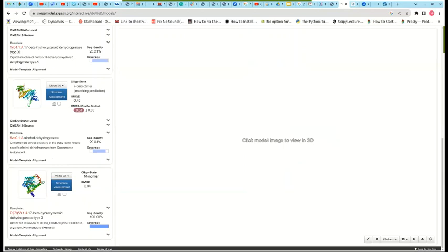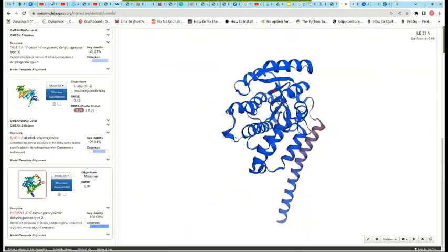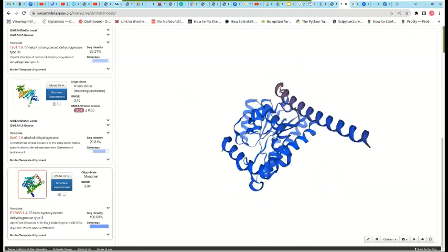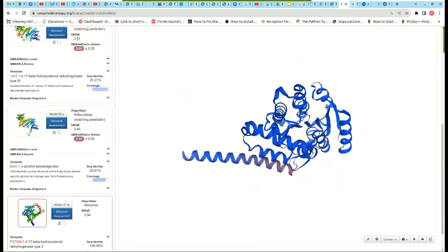The information we have is that it used the templates from AlphaFold. We'll see this code, which is actually the same as what we saw on AlphaFold. So this is exactly what you have on AlphaFold. You can decide to download all 4 or go for the best one.